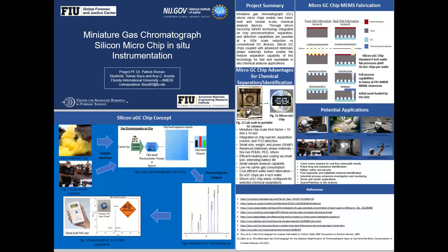Future plans that you'd like to communicate about this project? In the future, we're going to have to figure out how we're going to implement the heating element, because this thing has to be encased in some sort of insulator so that the rest of the components don't get heated up. So we have to fit a heating element in there and then the insulator so it can keep the electronics safe, because it's going to be near the microcontroller and a couple of other components inside the housing. Again, we don't want the heat to affect everything else. We want the heat to be contained only to the UGC. It shouldn't be too hard though, because the UGC is pretty small, so heating it will be easier, as well as making an insulative compartment will be pretty easy too, I think. We just haven't come up with an idea on how to do it.